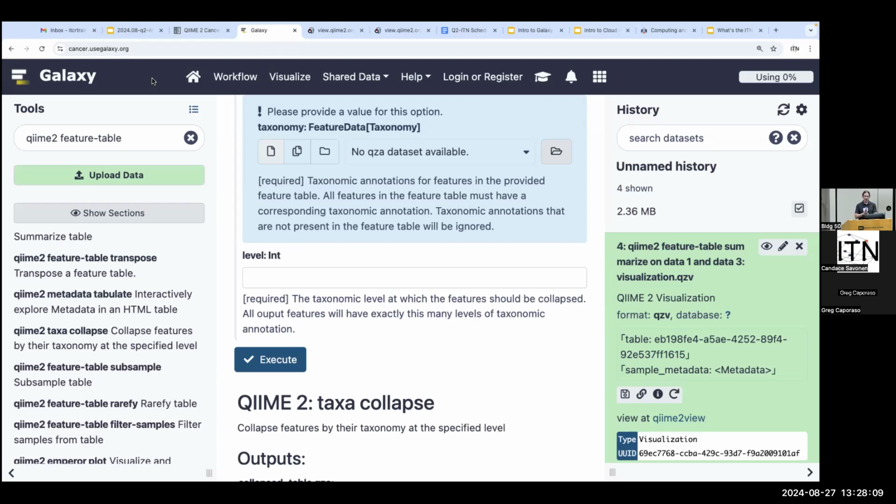And this is particularly slow because what we're doing right now is we're running these really quick steps. So like these things that really should have a very snappy turnaround. But we're spinning up a lot of computational infrastructure to do that. And so there's some fixed costs here.